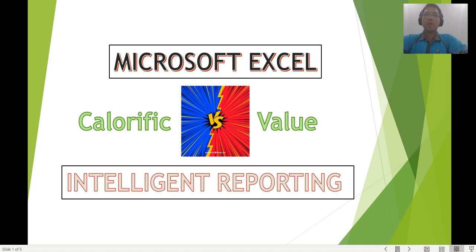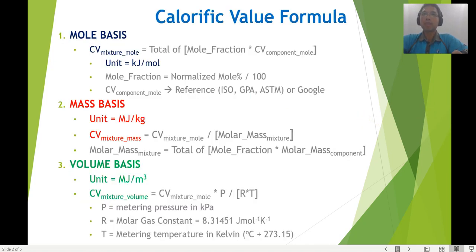In this video, we will have two different parts. In part one, we will be using Microsoft Excel to perform the calculation. In part two, we will be using Intelligent Reporting to automate the process. Okay, so let's first look at the formulas, how calorific values are calculated.